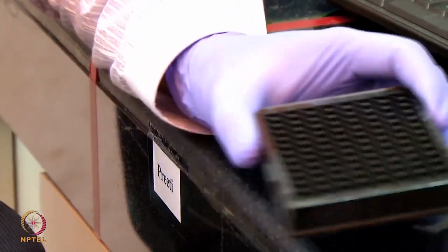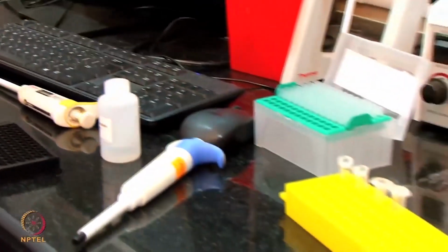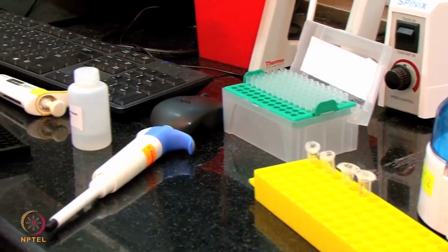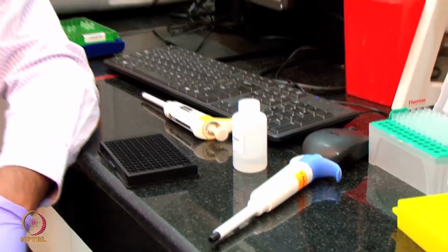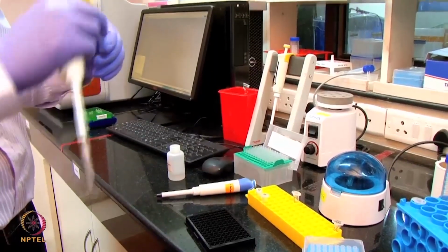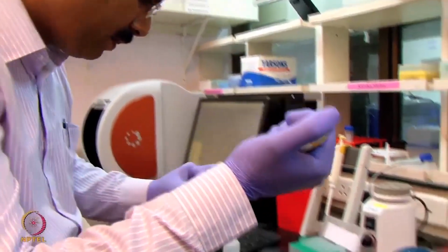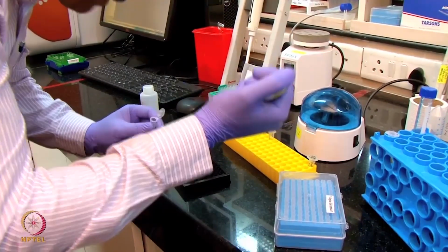Now I am going to add unknown samples. We have 3 unknown samples here. I am going to put them in B3, B4 and B5. With these 3 unknown samples we are going to determine the concentration of the unknown apolipoprotein in the samples using the standard. Now I am going to add the 3 unknown samples here. I am going to place it at B3. This is sample number 1.